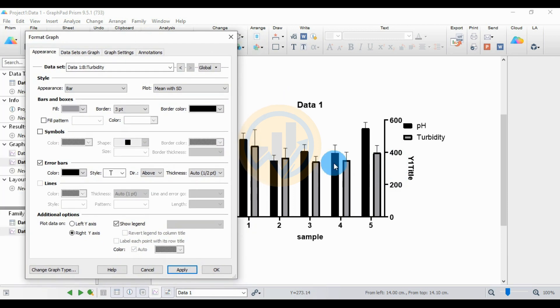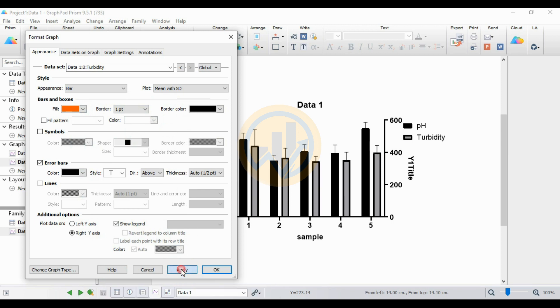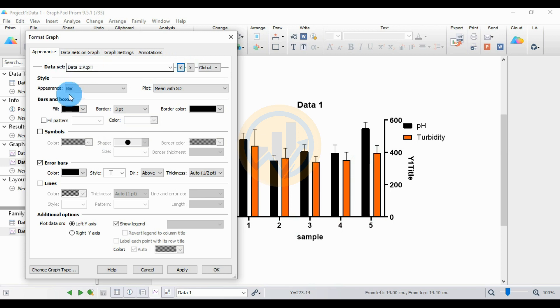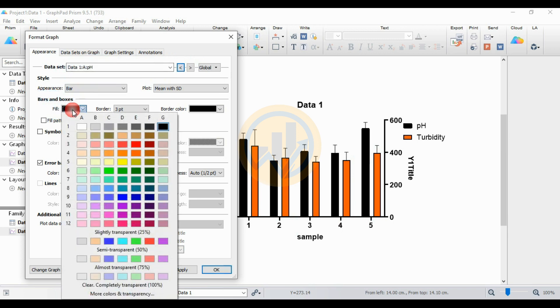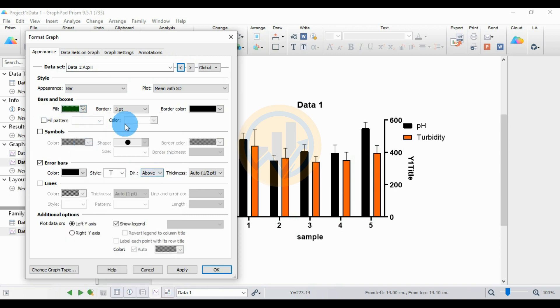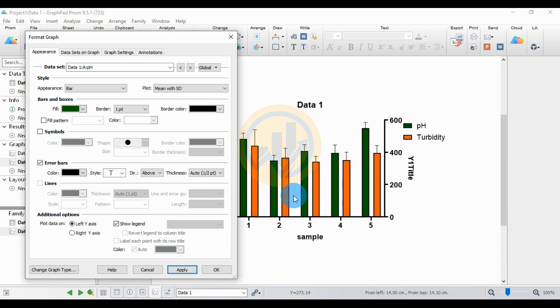Now change the bar color. Change the dataset for the pH data. Click the bar options in the box, click Fill Color, and change the bar color. Set the bar and bar border color — bar color is watercolor black. Then click the Apply button. The bar color is changed for both turbidity and pH values.